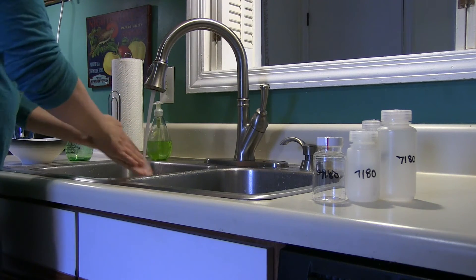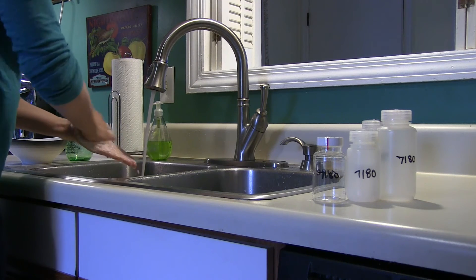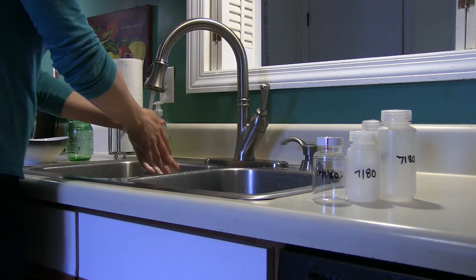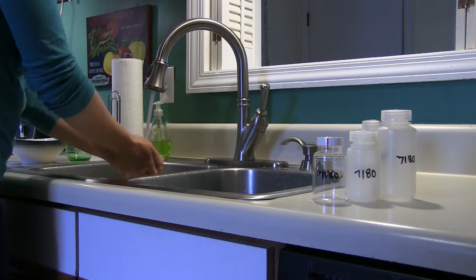Next, wash your hands thoroughly with soap and water while the water is running to avoid contaminating the sterile bacteria bottle. Leave the water running for at least one minute to flush the pipes.